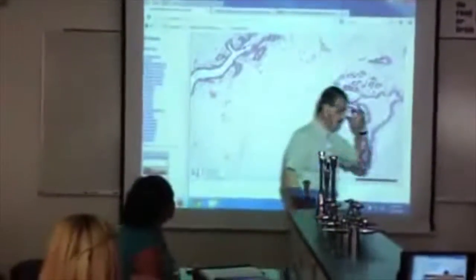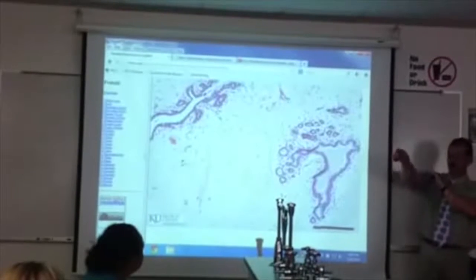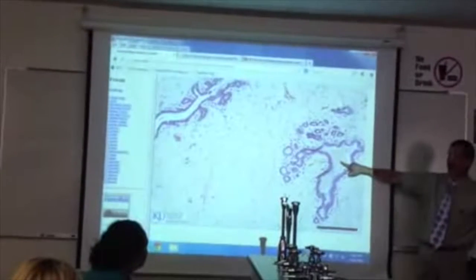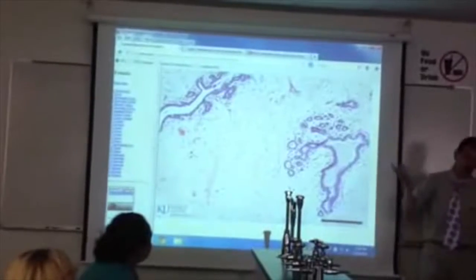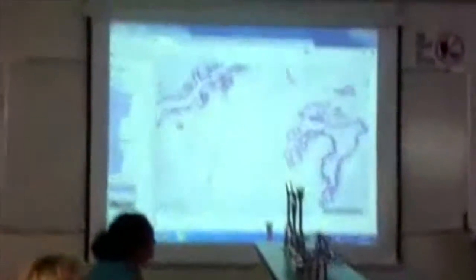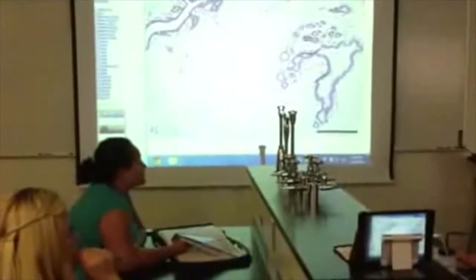So what you're going to do is look at those circles and have a gut reaction. Are they kind of big or little compared to everything else that's there? So the larger filled space with the glands, is that just a really large gland, or is that like a duct? That's going to be a duct. That's going to be a tube. Okay. Right now, compared to everything else, there seem to be a lot of them or a few of them? Few. Seem big or small? Small. They're kind of small. So this would be an inactive or not lactating one. You're not making milk. What you want to do is take a picture of that with your head, right?